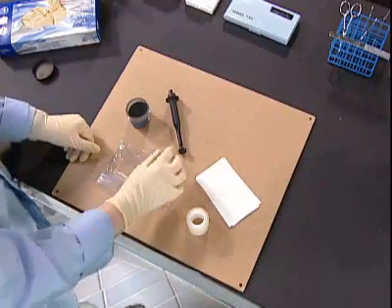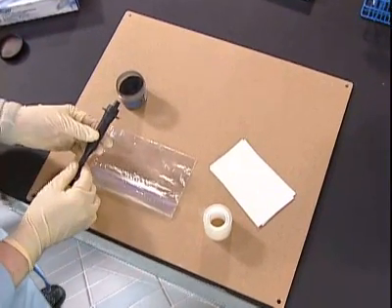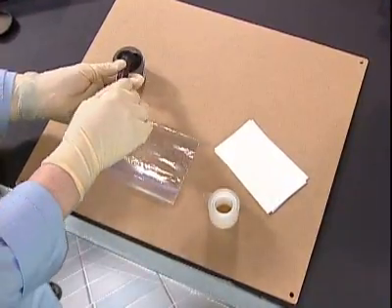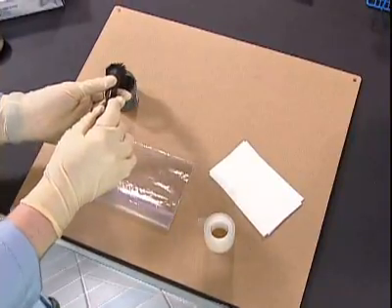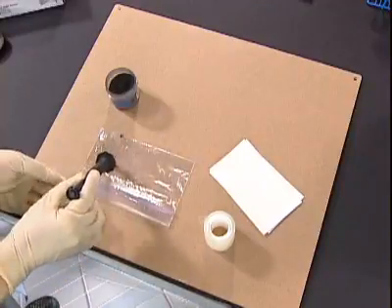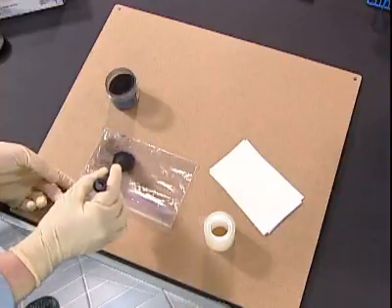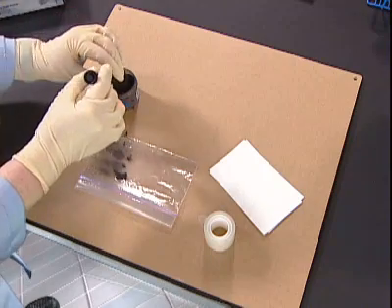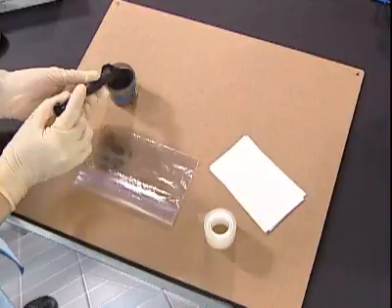This particular method of enhancement is one of those physical methods, and what I'm using is a magnet that's in this particular wand to lift up black powder that has metal fragments in it, and then just simply leave it over the surface to be processed and dust it back and forth so that you can now see how the latent fingerprints have become enhanced or visualized on the plastic bag.